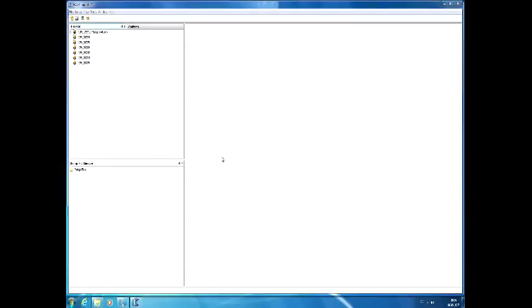And then afterwards, in the afternoon, we'll go and have a look at doing everything in MATLAB by hand. And this is important for everyone that does anything that goes beyond finding out concentrations in phases. So essentially, if you need to do any interface work, if you need to do anything with clusters, dislocations, and so on and so forth, or you've got multi-layer systems, or anything more advanced, you will need to work with MATLAB.